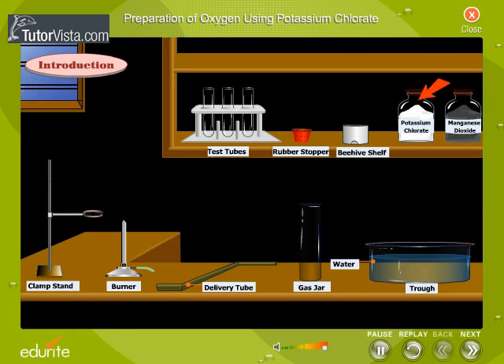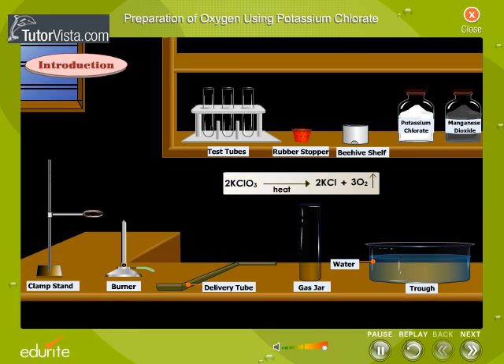Potassium chlorate and manganese dioxide are required. Potassium chlorate on heating liberates oxygen gas. This being a very slow reaction, manganese dioxide, a catalyst, is used.